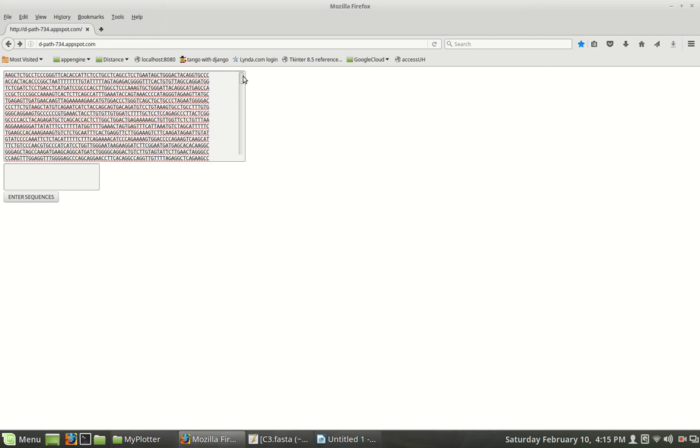So one way to do that, just to find out maybe where both genes are, which is part of your R assignment, maybe we should just find where there's greater GC content and where there's less. So I've done this with a different app, but I haven't done it with this one. So one thing we can do is we can just look for high levels of CG.